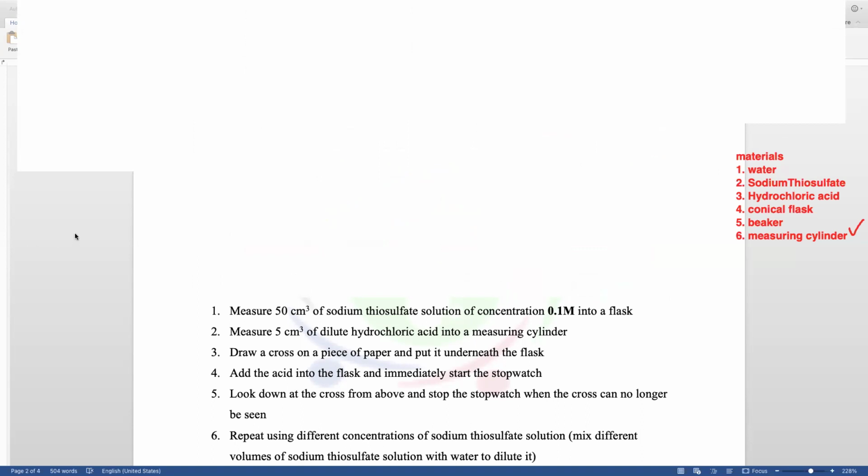So you use a measuring cylinder, and we all know how to measure. But above all, we need to understand that when we are measuring, the measuring cylinder has to be placed on a horizontal surface. So we measure 50, qualitatively and quantitatively, and we transfer it into the conical flask. We transfer 50 mils.